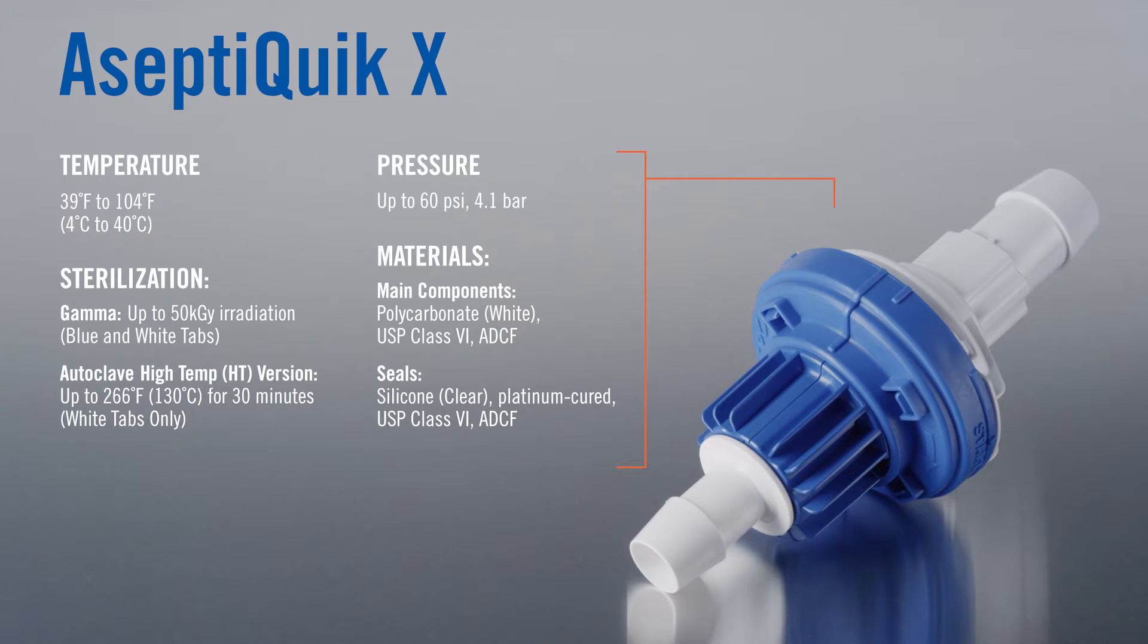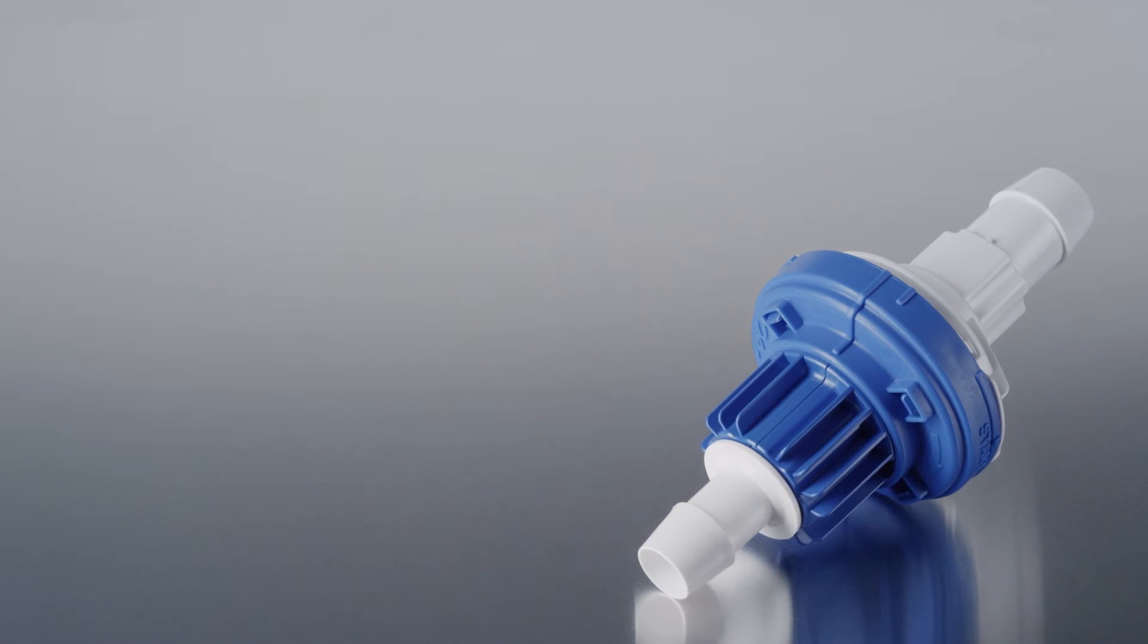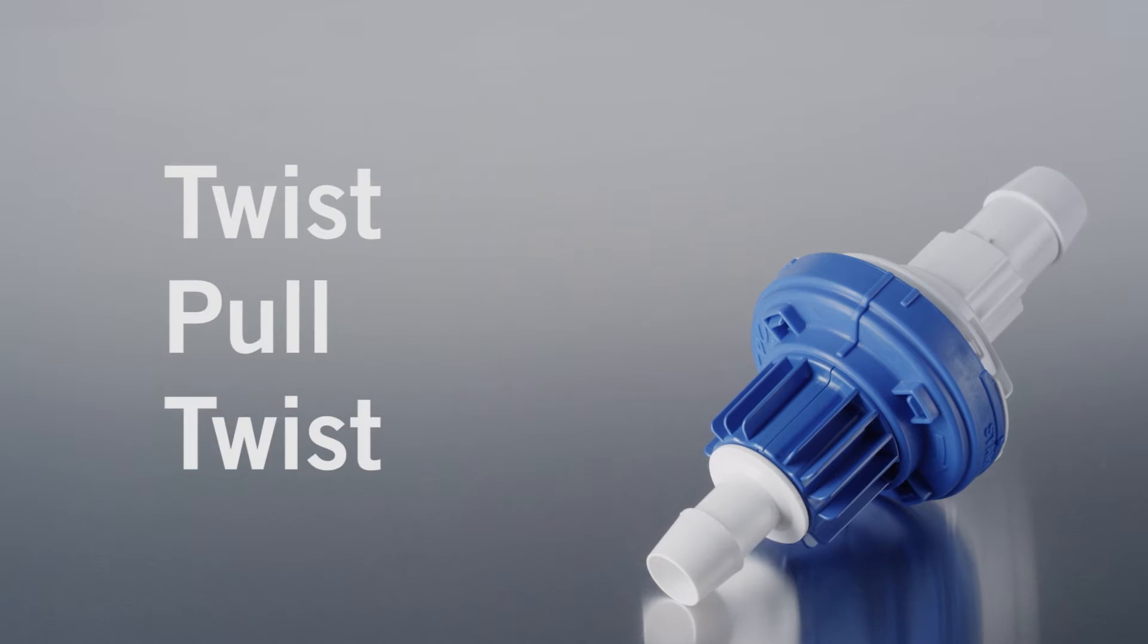Assembling the AseptiQuik X is a quick and easy three-step process: Twist, pull, twist.